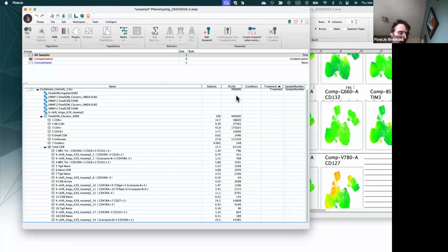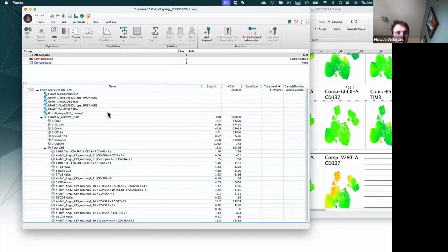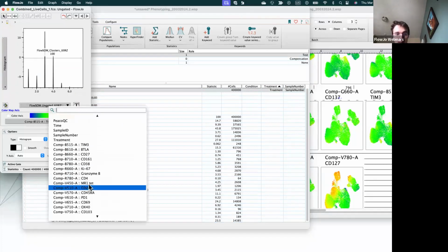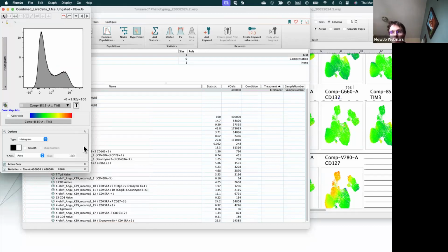There's a good question in the chat about changing the transform to remove white space or just making the transform good to maximize the separation of the two parameters. As far as when you should transform your data, one of the earliest things I would do when you load your data into FlowJo is transform the data and make sure all the transforms look good, because it will affect your future analysis. Sometimes we can save some of the previous analysis or adjust the transform later, but for some things, we need to set the transform before we do it.